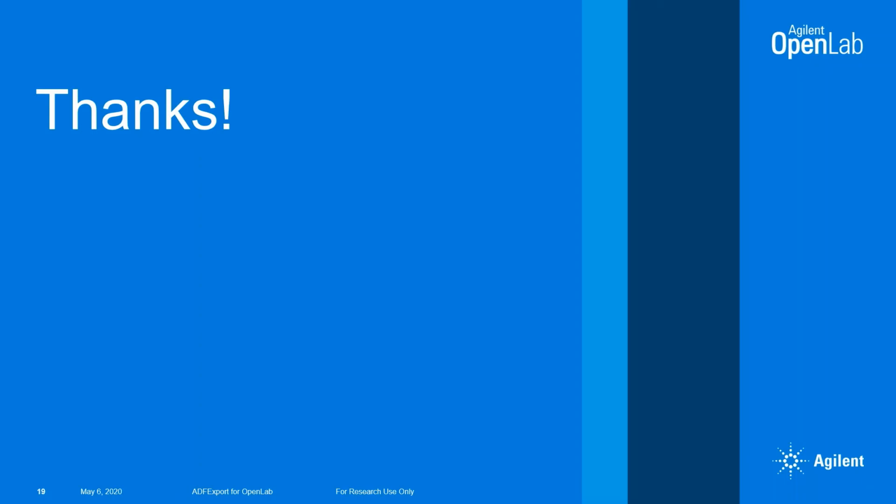All right, we have one hand raised. I'll unmute Manuel. Oh, hello. Yes, my name is Manuel, and I have one question. So far, I know the ADF Explorer, which always separates between the data description section, data cube, and data package. The viewer you were presenting does not really differentiate between these sections. Or did I just not see it? Can you explain again, please?